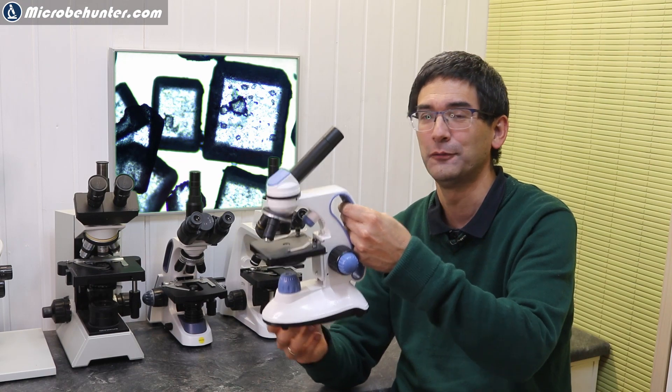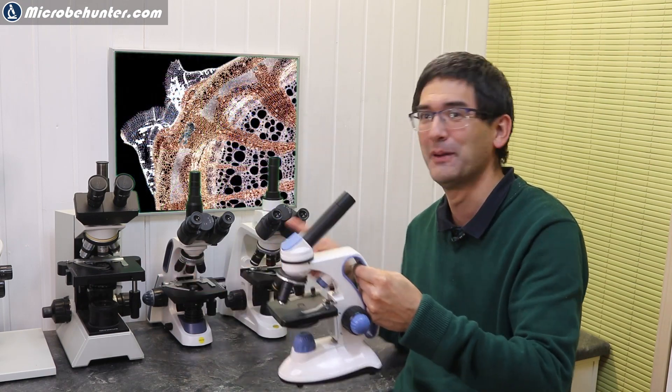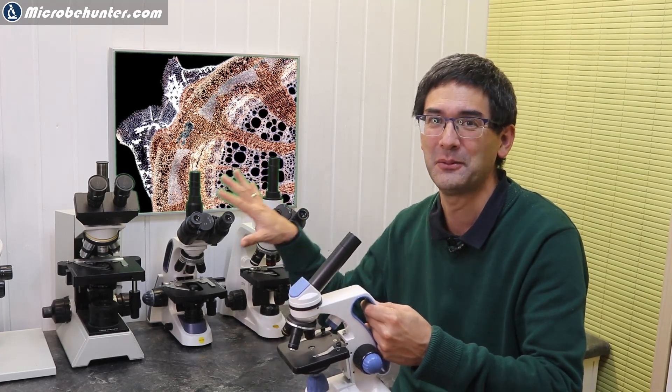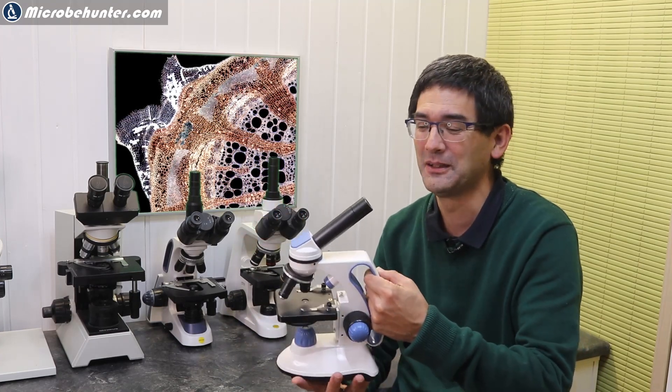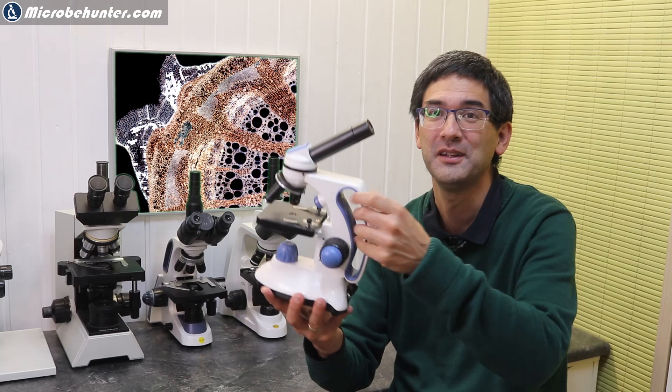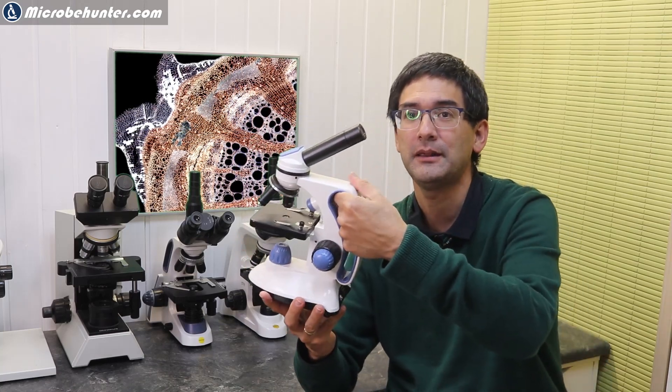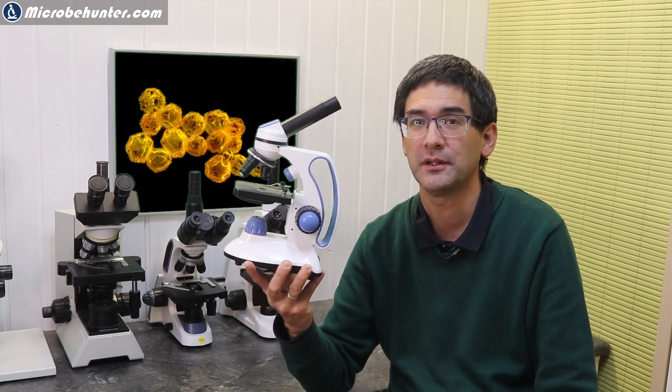Just look at the size difference, nice and portable. Look at those microscopes that I have here. They have to stay on the table, otherwise it's going to be too dangerous to carry them around. But this one can be easily carried around, has a nice grip here. Especially for schools and educational use, and especially if portability is needed, then those small microscopes are quite useful.